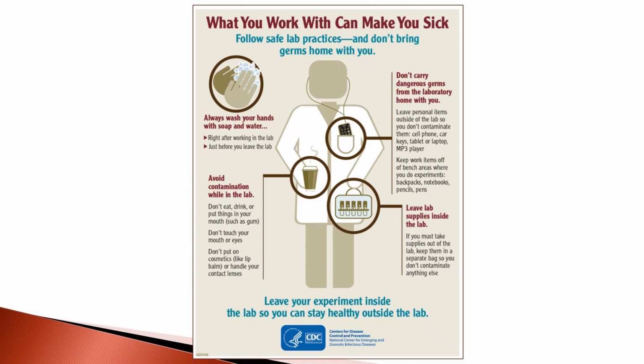apply that, and make sure you don't handle your contact lenses. Like I said, if something happens to your contact, you always want to walk out of the room after you wash your hands. Don't carry dangerous germs from the laboratory home with you. Leave your personal items outside of the lab so that they don't contaminate your cell phone, your car keys, your tablet or laptop, any other type of devices.